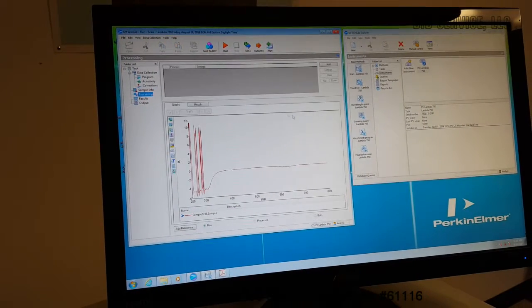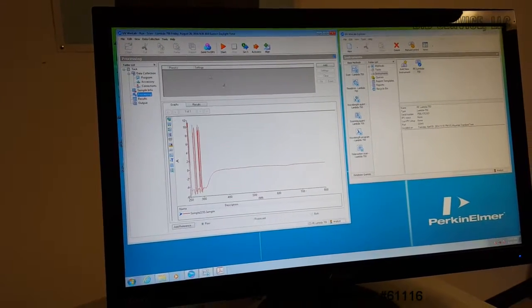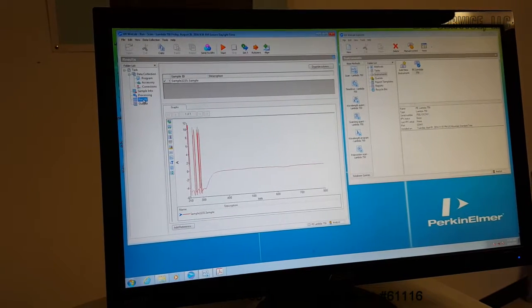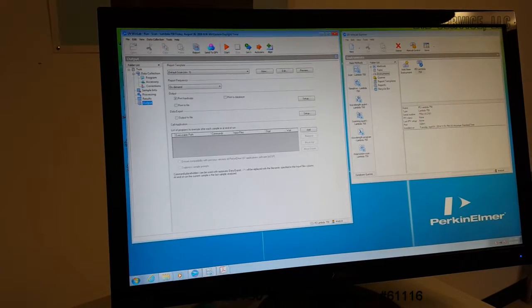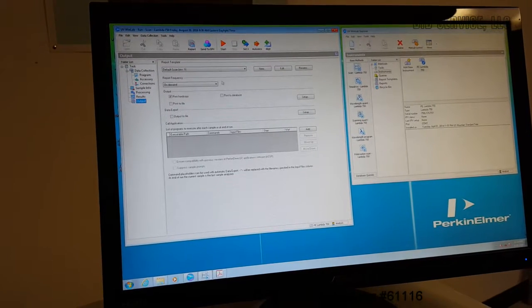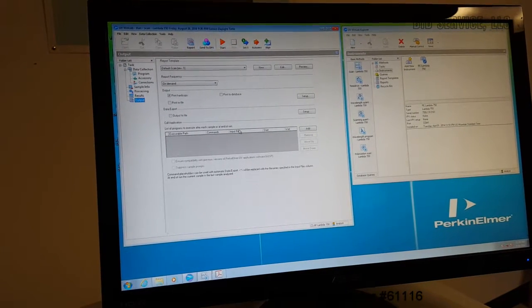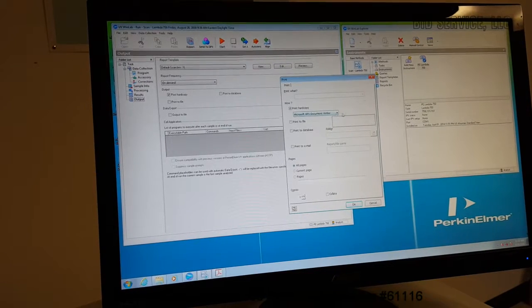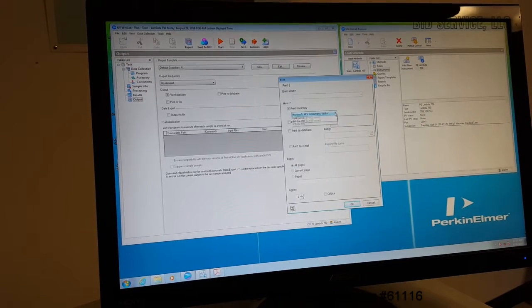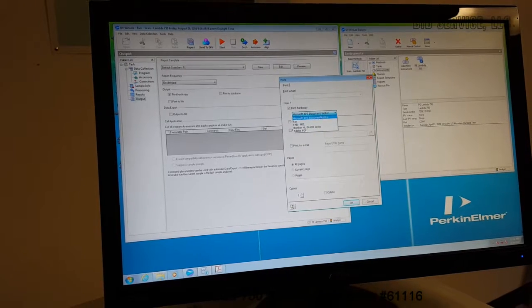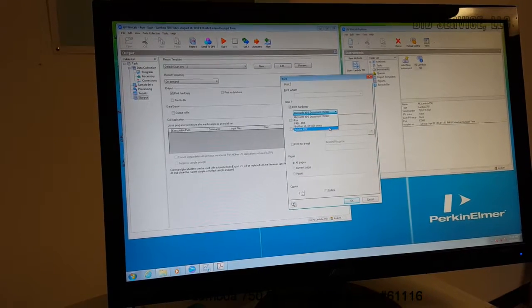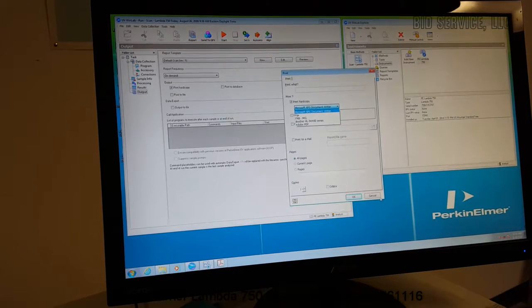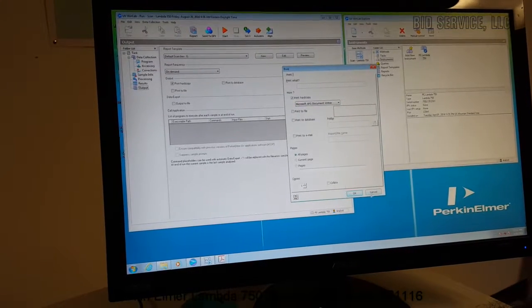And the processing, there's a window up here, which can be selected if necessary. And also, there's reports can be generated and written in Microsoft Excel sheets. Or can be printed, so the provision exists.